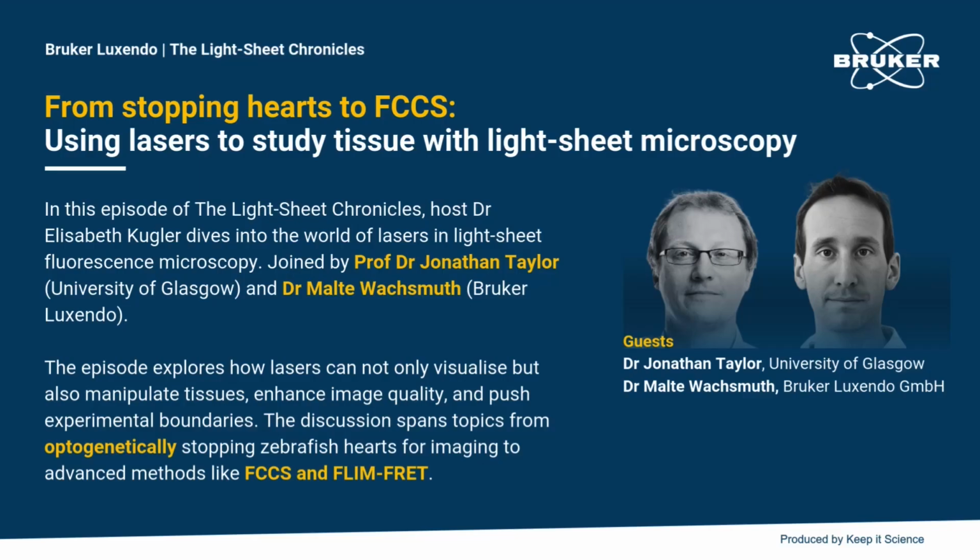That is something we like to do in our system, that in an image plane that is conjugated to the back aperture of the objective lens, we introduce a very rapidly tunable lens that oscillates between negative and positive refractive power. With this, you can, like I said, rapidly axially scan the beam waist from the left to the right in the field of view, so that you have a very homogeneous, averaged out intensity and also beam width.